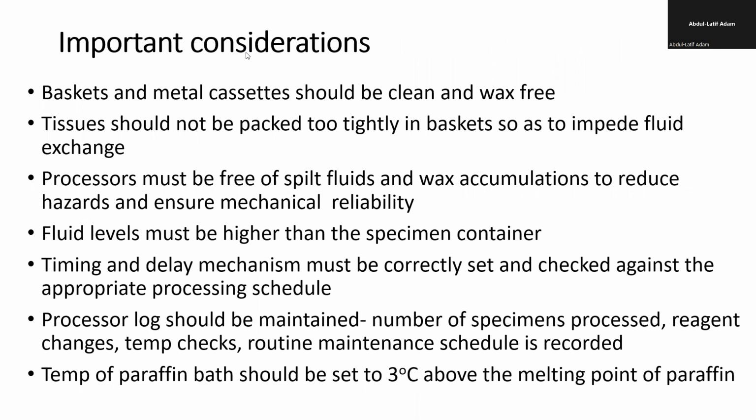so now let's look at some important considerations you look out for when you are processing. One thing you will look out for is to make sure that your sample containers, the tissue cassette containers, so the basket and the metal cases where you keep your cassettes, your tissue, are clean. Cassettes are the plastic meshy containers that you cut the tissue and place them in.